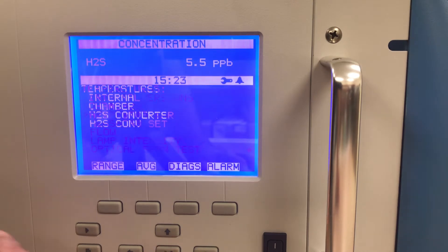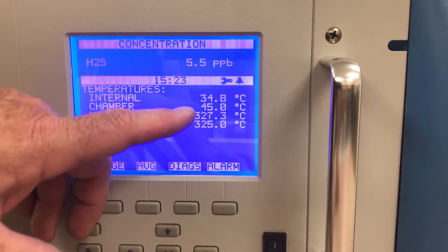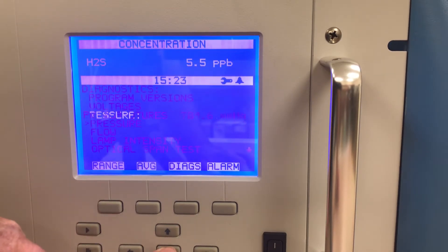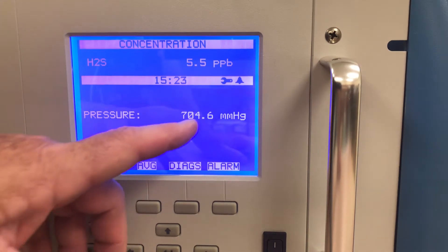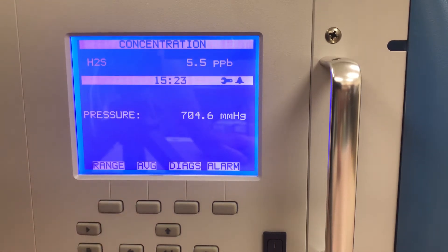I can look at temperatures — internal, chamber, inverter temp — and see what they are versus the set points. I can also look at pressure. If I don't know when the last pump repair kit was replaced because there's no logbook, I pretty much have to watch the pressure. If it's increasing, I know it's a good time to change the diaphragm on the pump.